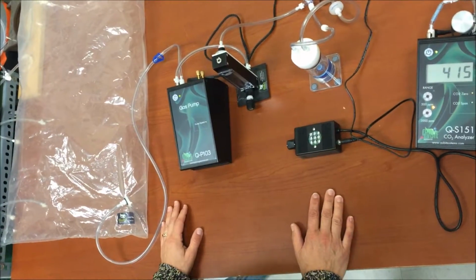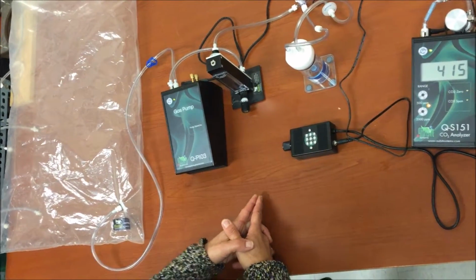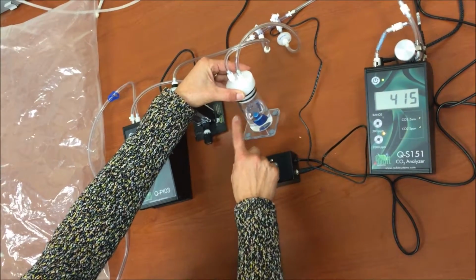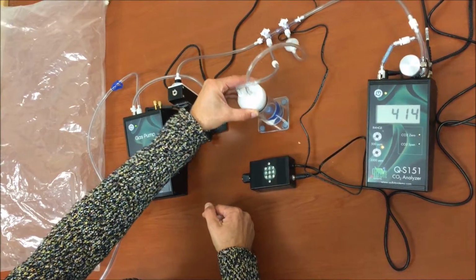This is Algal CO2 Package FL23. This package is designed for measurements of CO2 in the gas phase above an algal culture, which has been placed inside the algal chamber. Right now we just have water here for demonstration purposes.